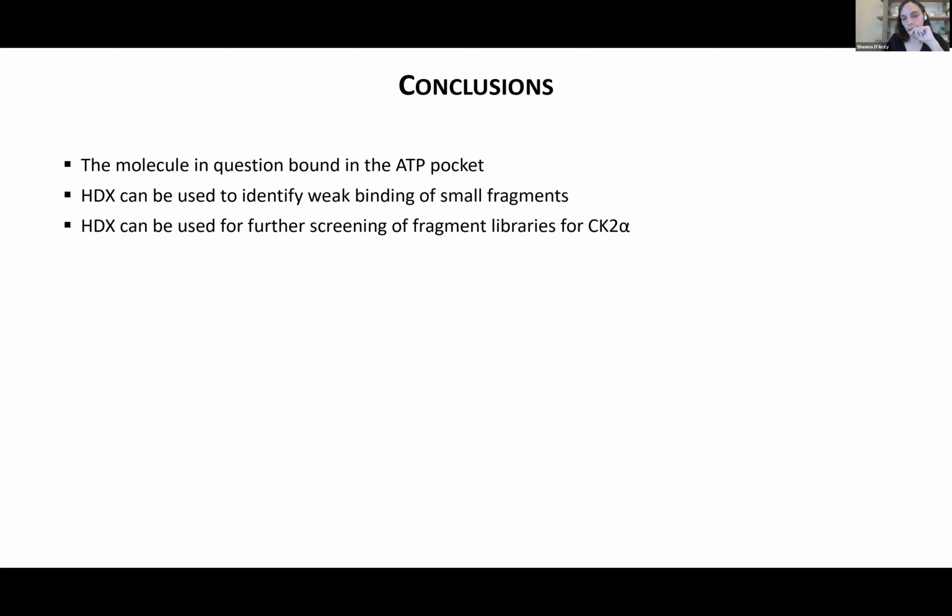Hello, hi Sheena, it's Tom Neville here, I work at CSIRO. I've got a question about the software that you created, the HD Explosion. I was wondering if that is open access, if that's available for everyone. I also know that the Pasteur Institute has open access software, I think called MEM HDX. I was wondering if you've tried that one and what your experience with it was.